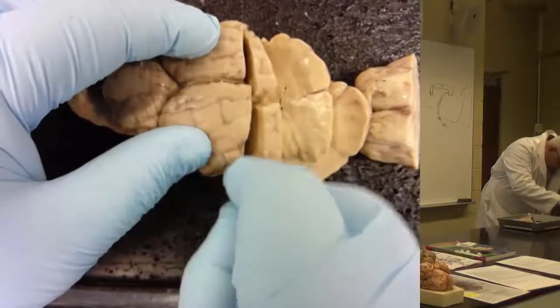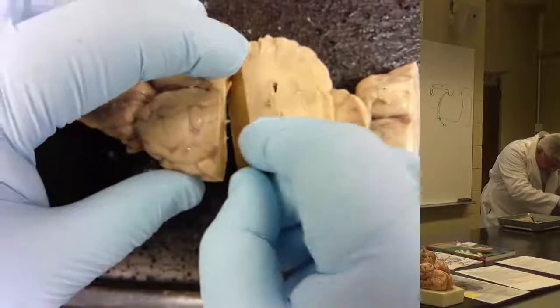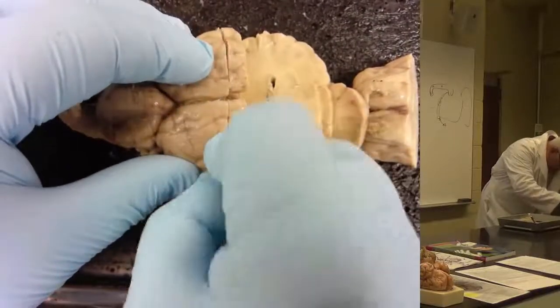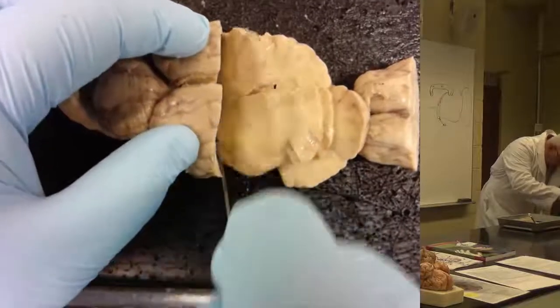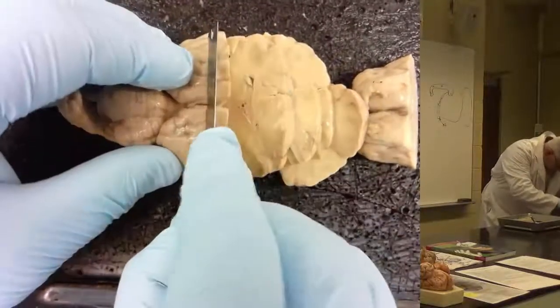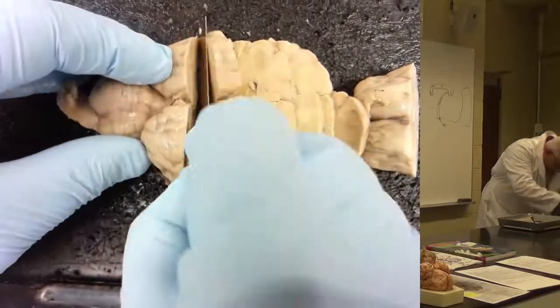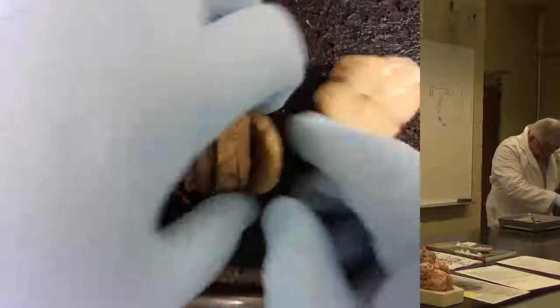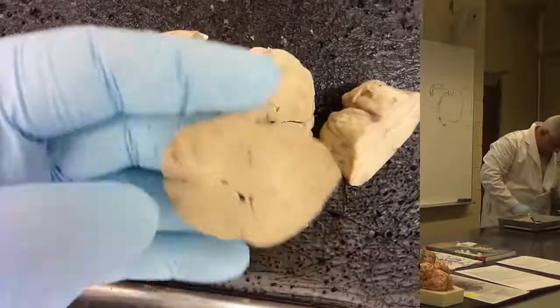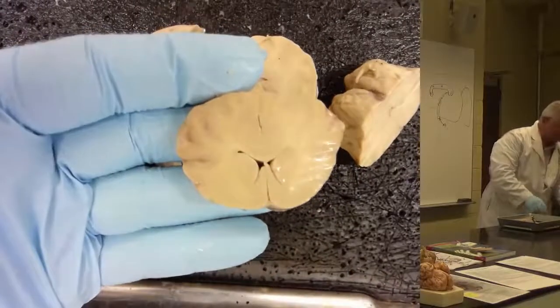Now, you can see why it's really important that you look at a lot of brains, because every time I make a cut through here, it's going through a different part of the brain. And the angles are different, the brains are different. All right, let's start at the front and work our way backwards. Okay. That one you can see a little bit better.